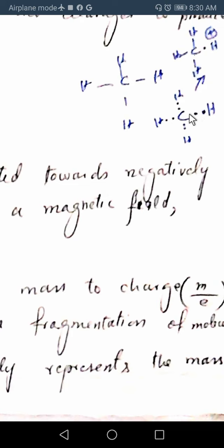Then when it is bombarded with an electron, one of the electrons will be removed from the bond and it is changed into this one. One electron is removed, and CH4 becomes positively charged. This is called the molecular cation. Why is a positive charge produced? Because one electron has been removed from this molecule. So this is positively charged.